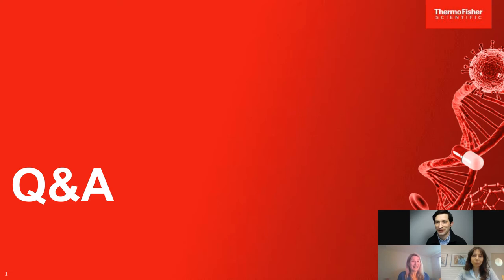Thank you. Maybe Selma, you can add to how you're doing it, which I think is a BSL2 facility in your case. Yes, it is. I mean, it's what you said. This is what we are doing. So we have a physical separation between the microscope and the plunge freezing room, the cryo room. Also, everybody is aware that it's the BSL2 sample preparation room. So you have to wear gloves, whatever you do in this room. And then you need to make sure that you follow the instructions for the pathogen you're working with.